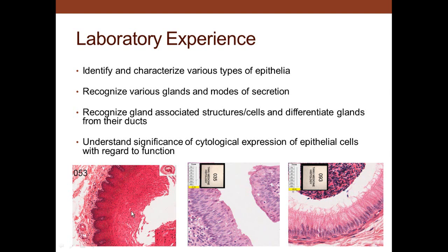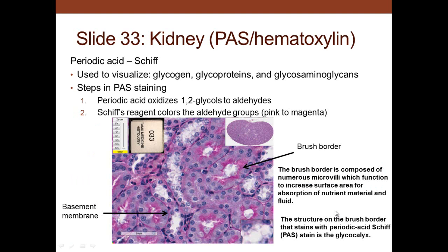Here we see stratified squamous epithelium, which is a protective type of epithelium. Here we see transitional epithelium in the urinary tract. Here we see pseudo-stratified columnar epithelium with very long microvilli projected on the surface — these are stereocilia. One characteristic of the epithelium is that it sits on a basement membrane, which we can see as a red-pink or magenta line. We can see this with a periodic acid-Schiff reaction that identifies locations of sugars, turning sugary structures pink or magenta.